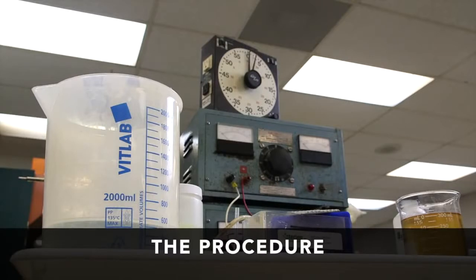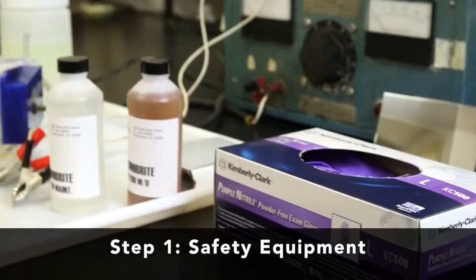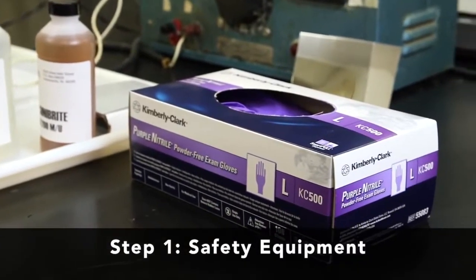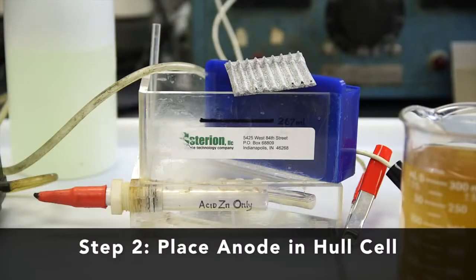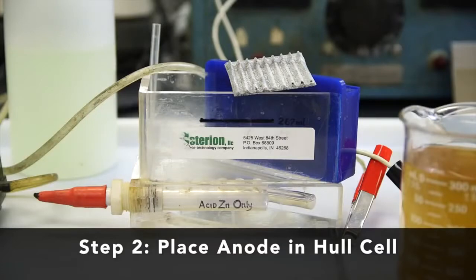Now that we have all of the necessary equipment, we're ready to get started. We will be running an acid-zinc Hull cell, processed at 2 amps for 5 minutes at ambient temperature with air agitation. Step one: put on your safety equipment. Then place the anode in the Hull cell — this is an acid-zinc process, so we will use a zinc anode.